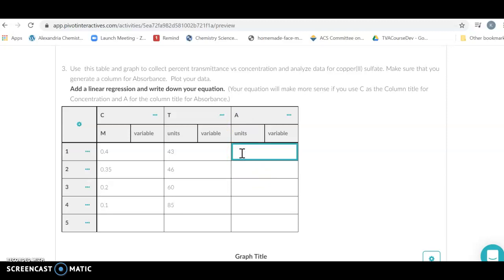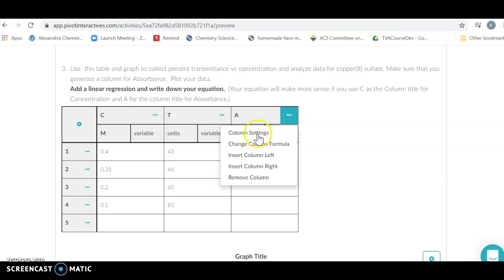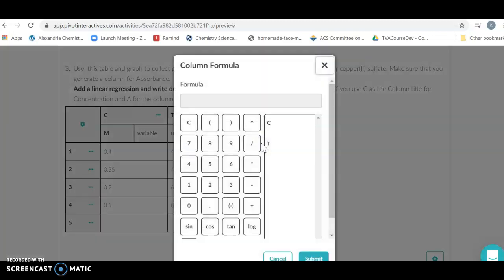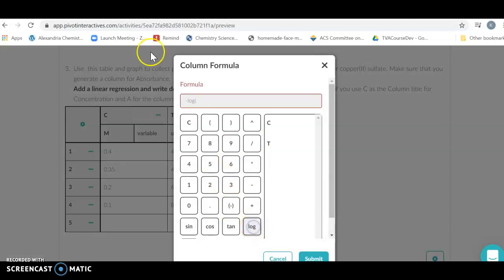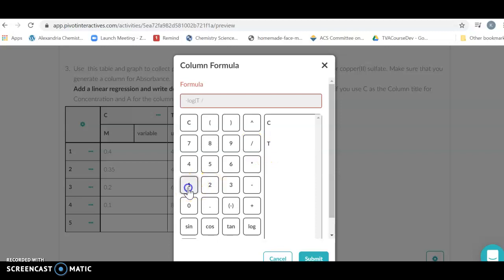We're going to switch to absorption. Now we can let the data table do our math for us. If I click on these three dots, I can change the formula. What I'm going to do is put the minus log of the transmission because that's the formula for absorbance.